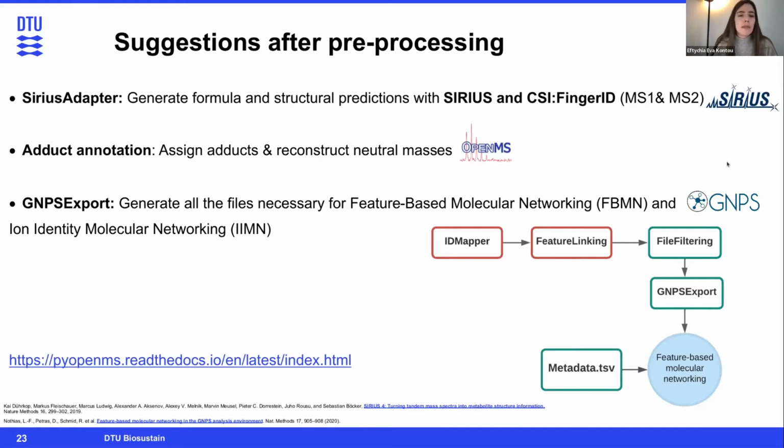And that's basically just a table of metabolic features in a format specifically that GNPS is expecting to receive. And then finally, the metadata table can also be generated from just a small Python script, basically using data frames. And surprisingly, doing it manually can generate a lot of errors in my experience. So it's good if you can do it through a tiny code.